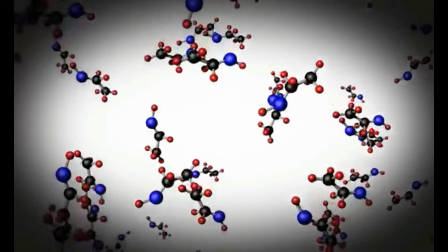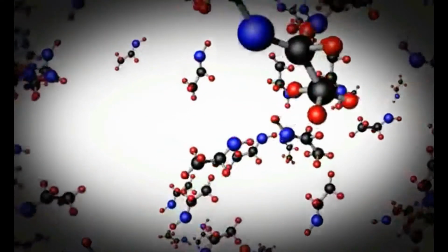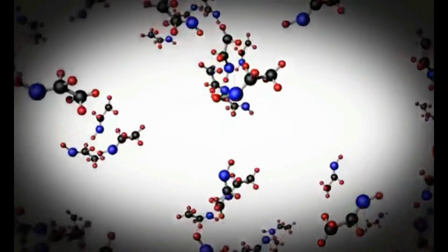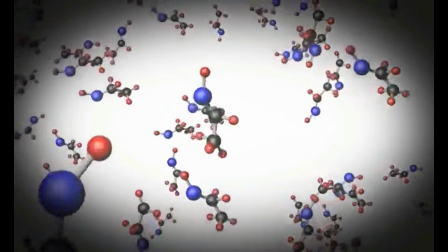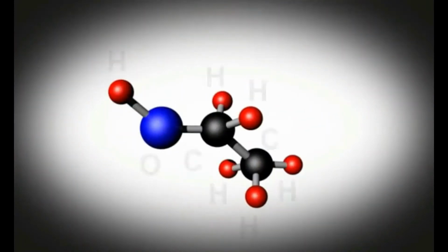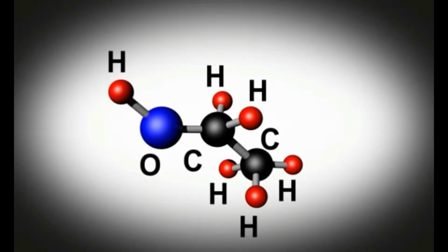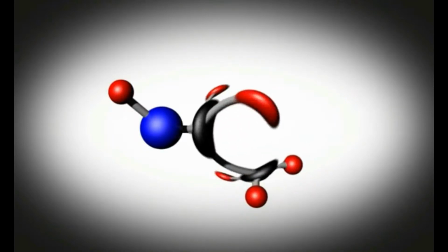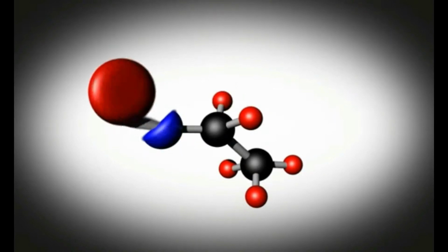This is the ethanol solution at a molecular level. Now, since it's a liquid, as you can see, the molecules are relatively free to move as they want. Now let's look at one of the molecules. As you can see, it's composed of CH3CH2OH, and, as the name implies, the H-NMR focuses mainly on the H atoms.